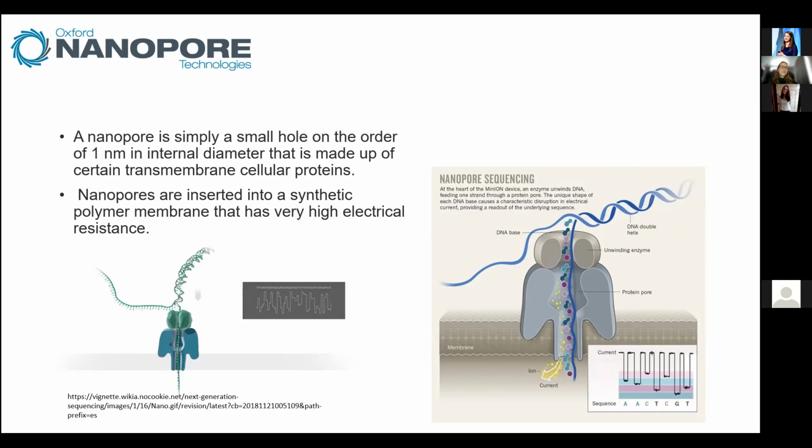The single-stranded DNA is introduced into the nanopore by entering from the microscopic opening, and this sample is in an insulating membrane between two compartments filled with saline solution, and an electric potential is applied across the membrane. The way in which the bases influence the electric field through the nanopore is measured. These measured data can be decoded to retrieve the DNA sequence.